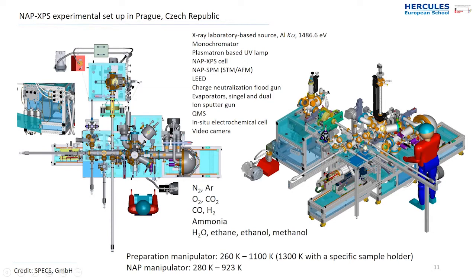Here is the hemispherical analyzer. Those are the optics. This is the entrance of the analyzer with those electrostatic lenses. Here is the first pumping stage, second and third. Each of them is pumped by turbomolecular pumps, pre-pumped by scroll pumps. On this stage, we have installed the quadrupole mass spectrometer. Here is a load lock where you put a sample for the very first time before you start the measurement. Its volume is quite small, so it's very easy and fast to pump out.